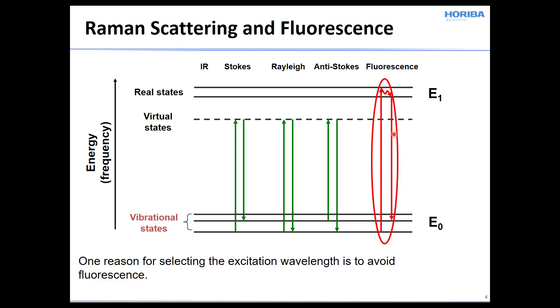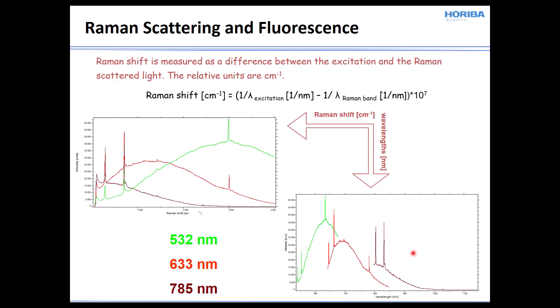that's a fluorescence photon, and then the electron drops back down to the ground electronic state. And now what you have is an emission that is competing, a fluorescence emission that's competing with the Raman scattering. And that is one of the reasons for selecting an excitation wavelength to avoid this kind of fluorescence. And so you want to avoid this kind of absorption and subsequent emission as a result.